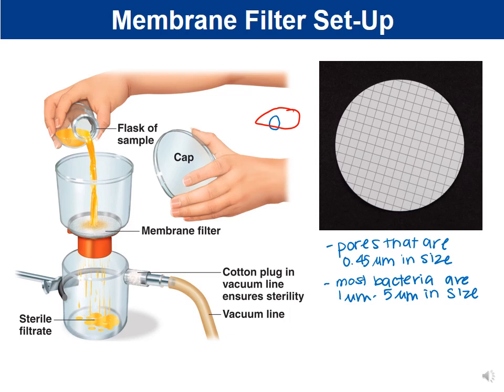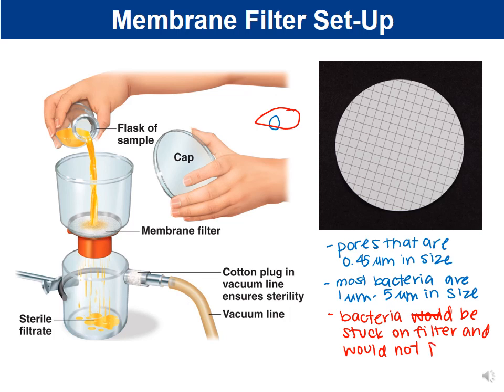And so the answer is bacteria would be stuck on the filter and would not pass through.